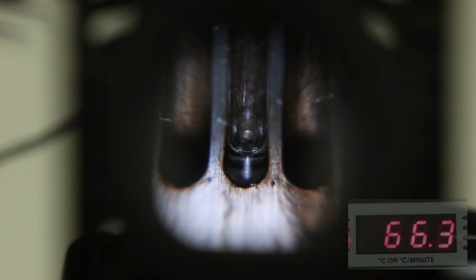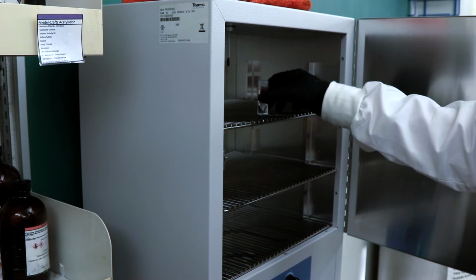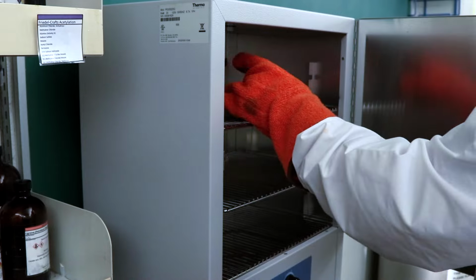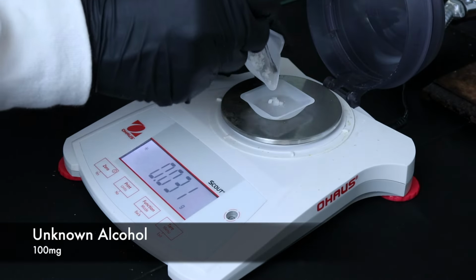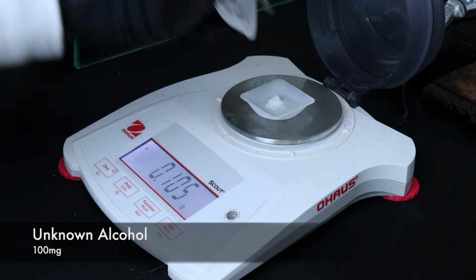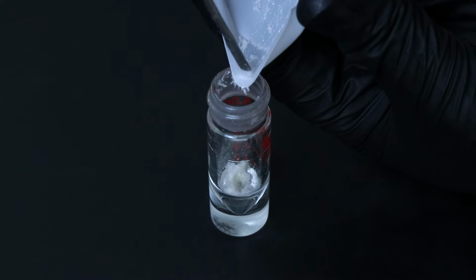Now that the melting point has been obtained, I can start the derivative reaction by heating up a conical vial and a spin vane in the oven for 15 minutes. Then I'll weigh out 100 milligrams of the unknown alcohol crystals and add that to the dry 5 milliliter conical vial.